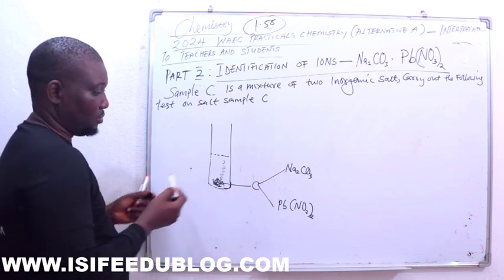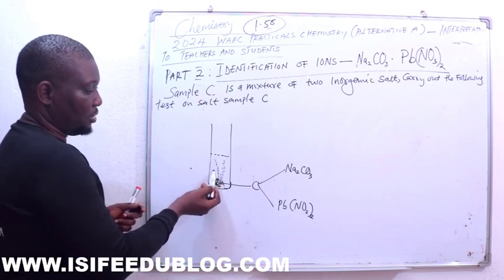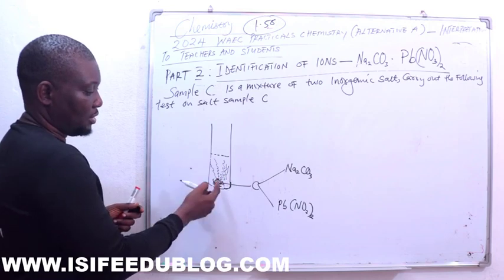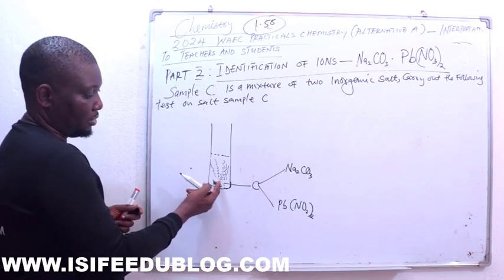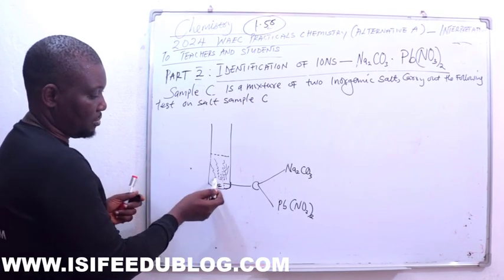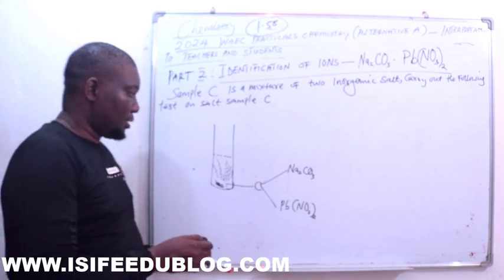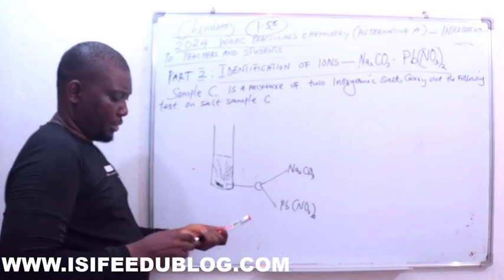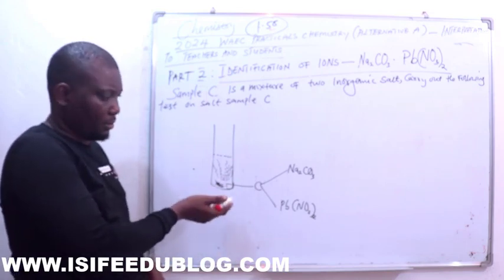When it is dissolving, some of the sample is reducing. So this is the amount that was able to dissolve, the extent of the dissolution. It does look like something is going to remain after this dissolution.